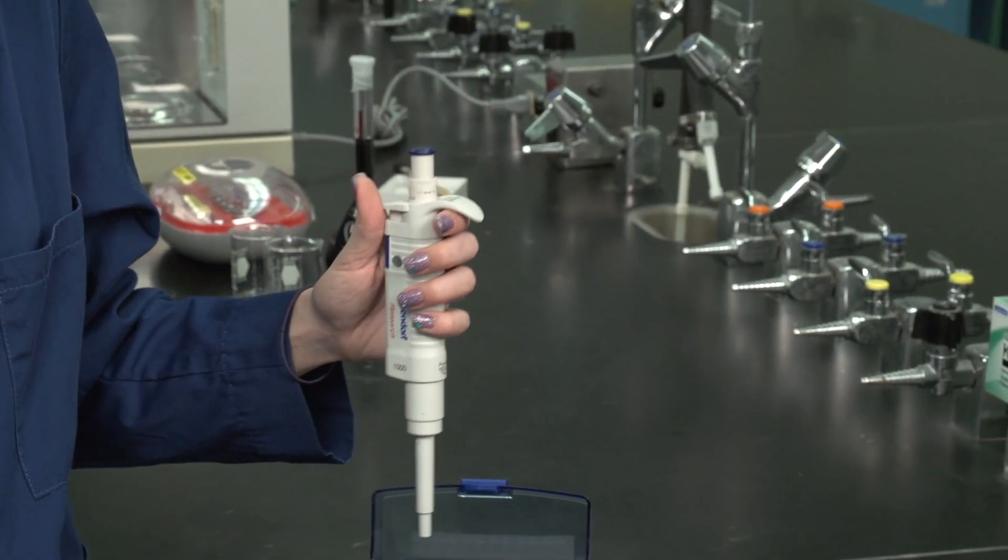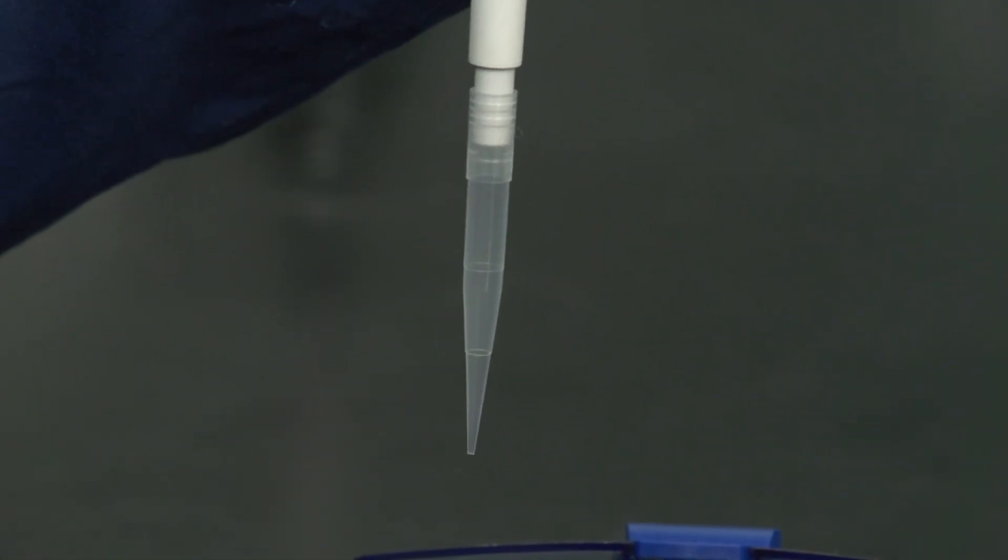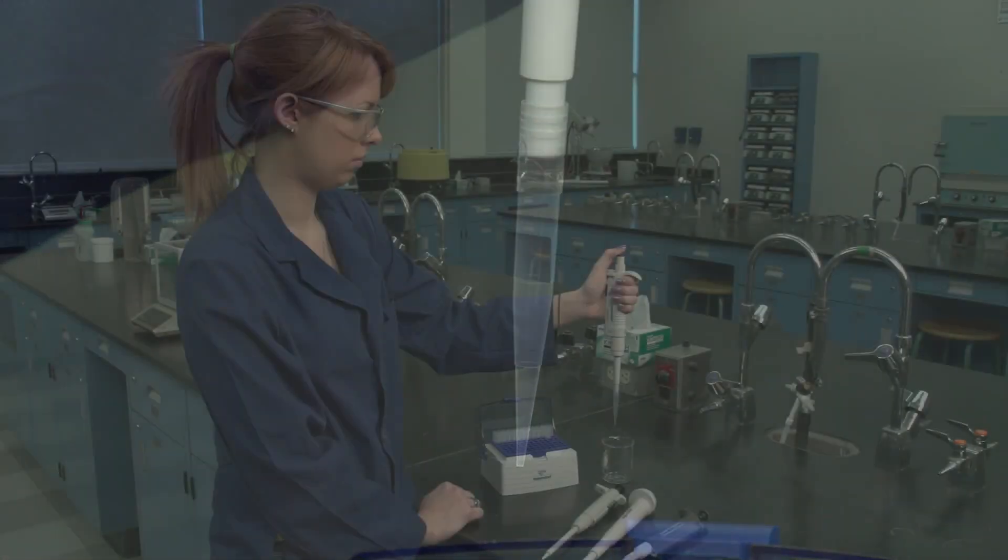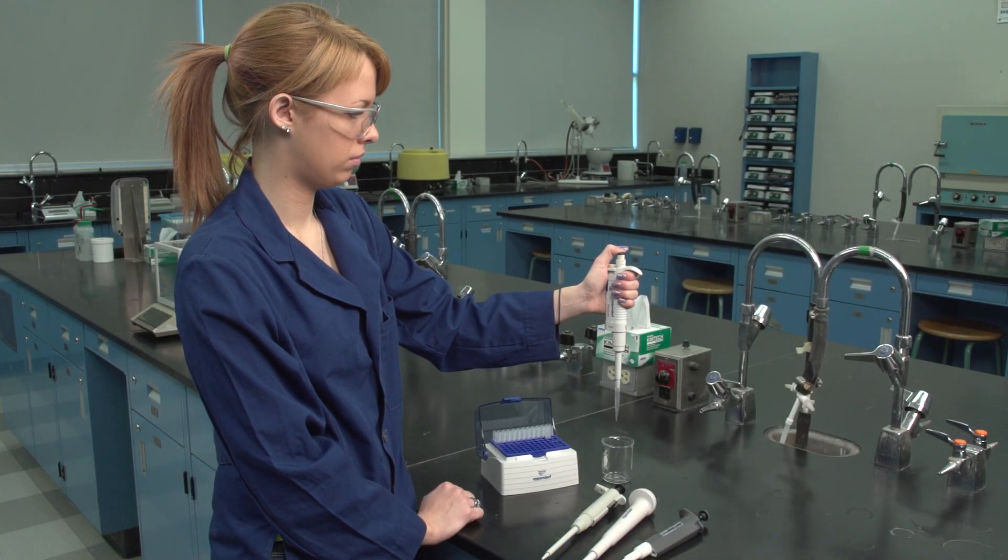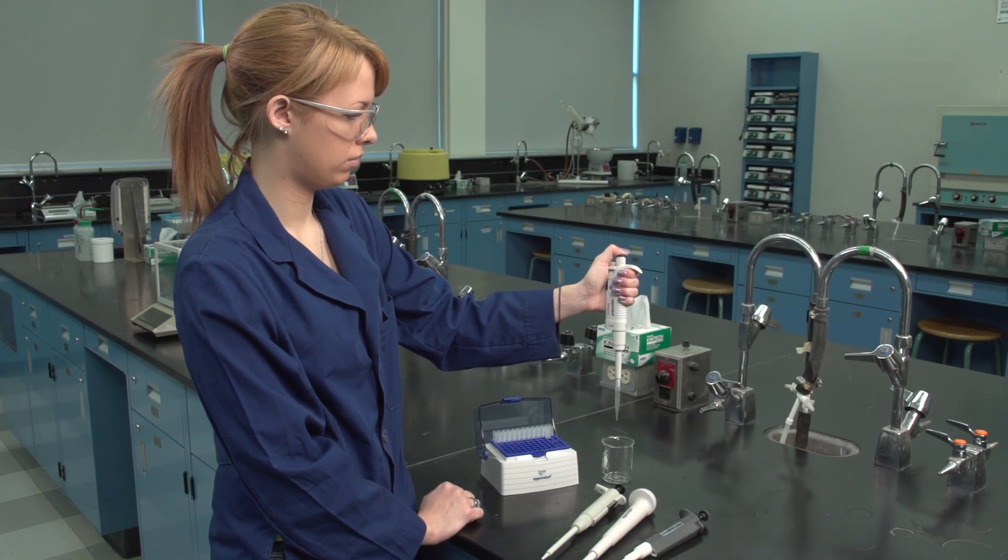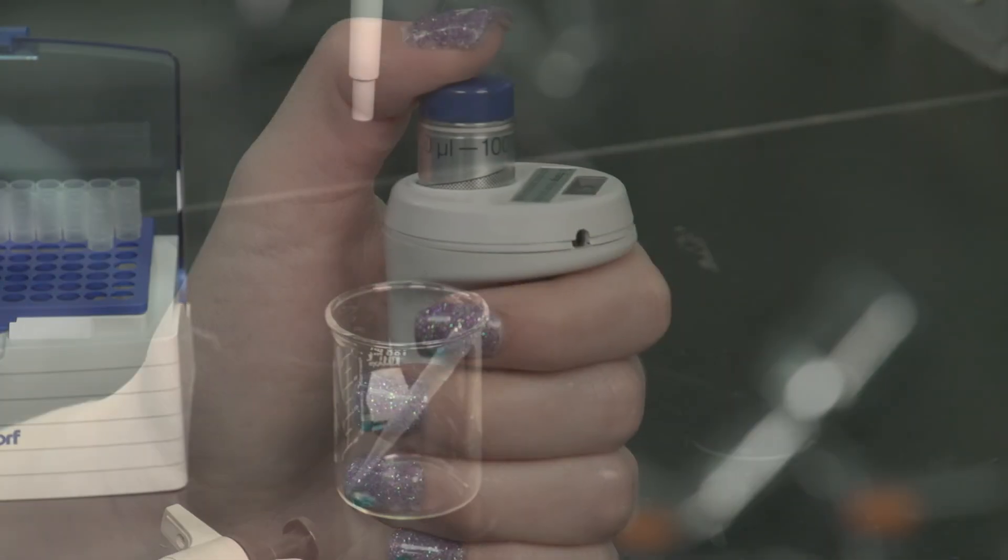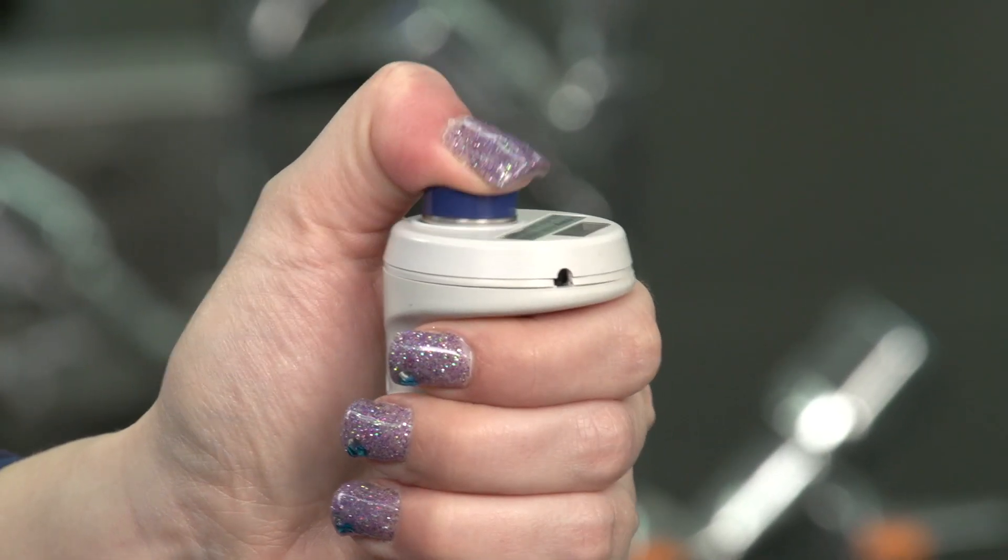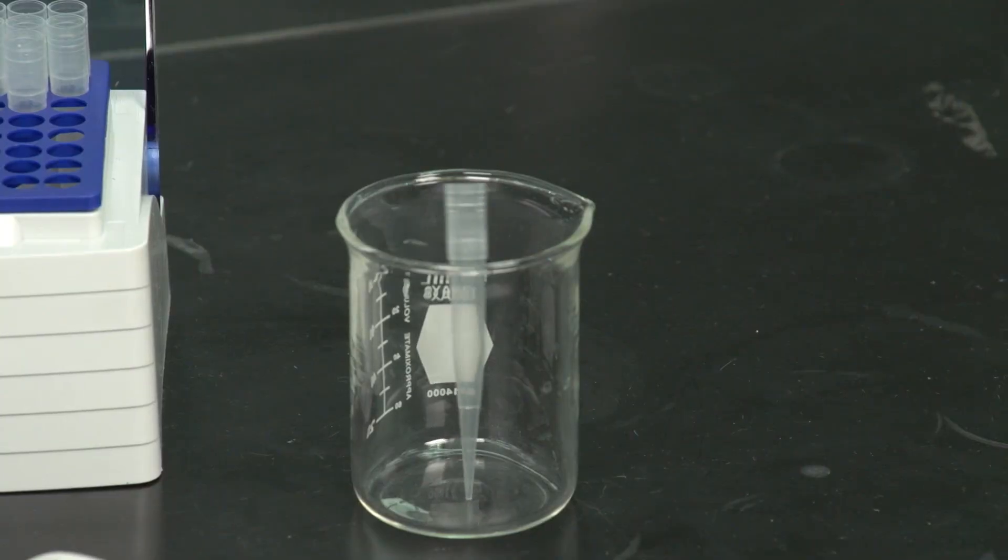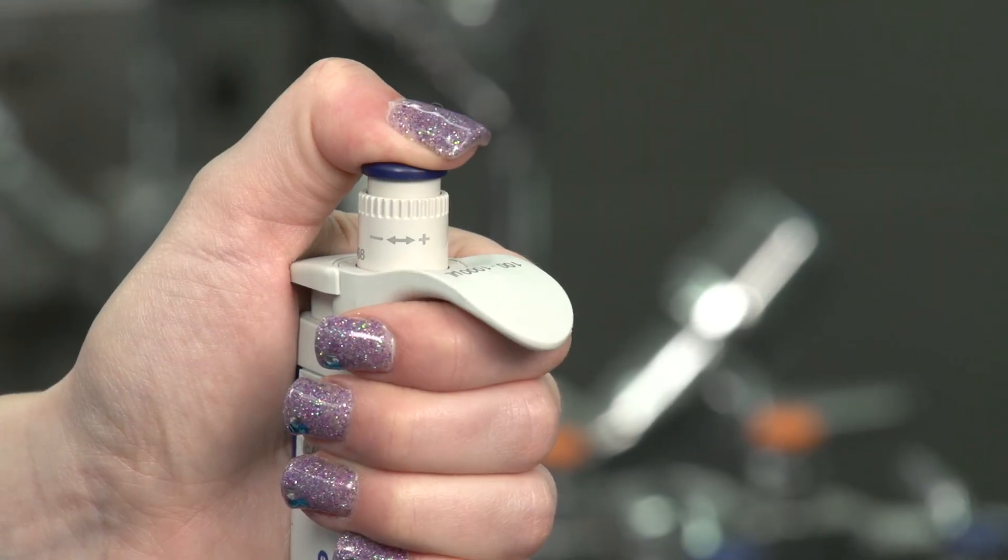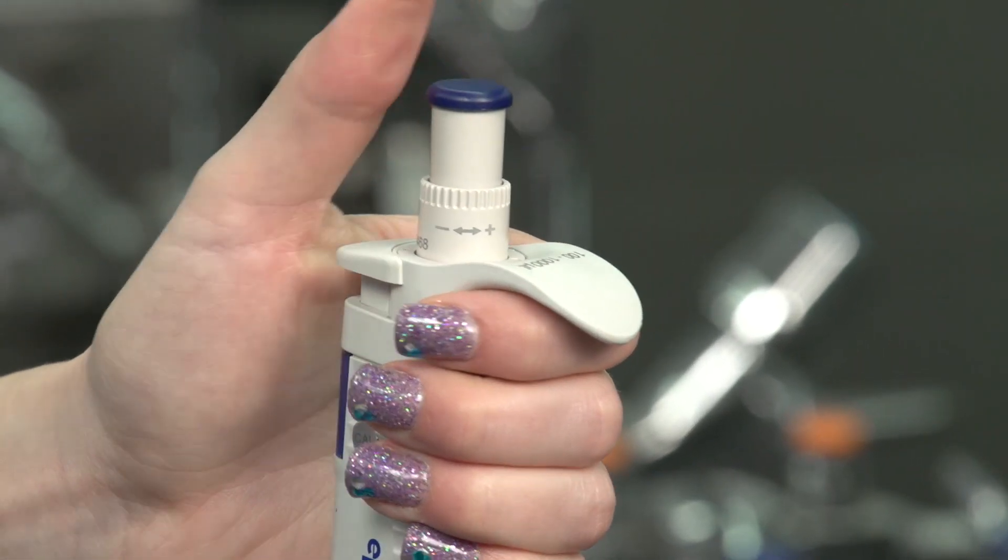Attach a clean tip to the pipette. Never immerse the micropipette into any kind of sample without attaching a disposable tip. Some micropipettes have a plunger with two stops to dispense the liquid and a separate button for ejecting the tip. Other micropipettes have a plunger with a third stop for ejecting the tip. Today we'll use a micropipette with two stops and an ejection button.